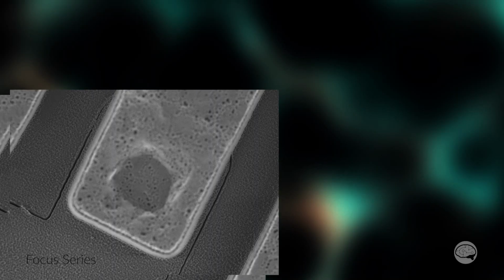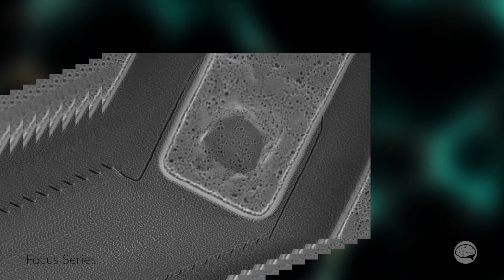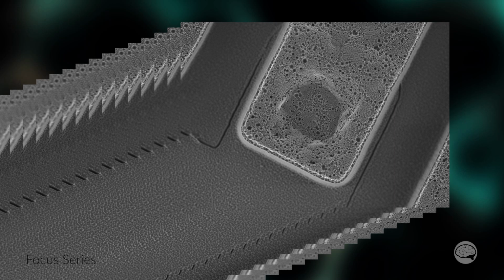I'll explain that in a minute, but let's first talk about how the data collection would work in the SEM. I see a few ways that it might. There may be other ways of doing this, but the option that I know actually does work is to capture and save a series of images with a known change in focus in between them. Anyone can do this right now manually. The problem is adjusting the focus the exact same amount after capturing each image and knowing exactly how much that change of focus actually is. You need to know down to the nanometer, and most instruments out there are not going to let you know that information. What you really need to do is to change the current in the objective lens a set amount and know exactly how much that changes the working distance. If that process could be automated, this method could be very good.